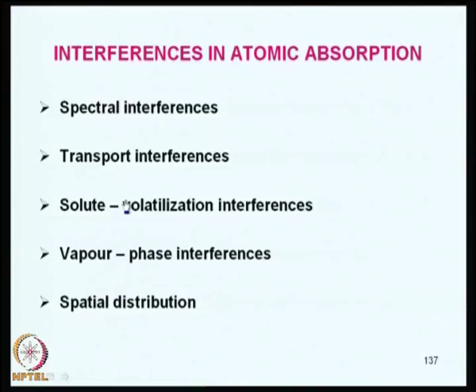So, we can consider the interferences in atomic absorption from their respective characteristics.